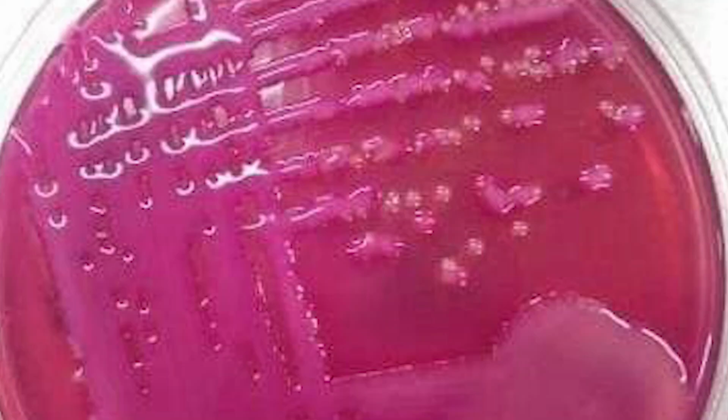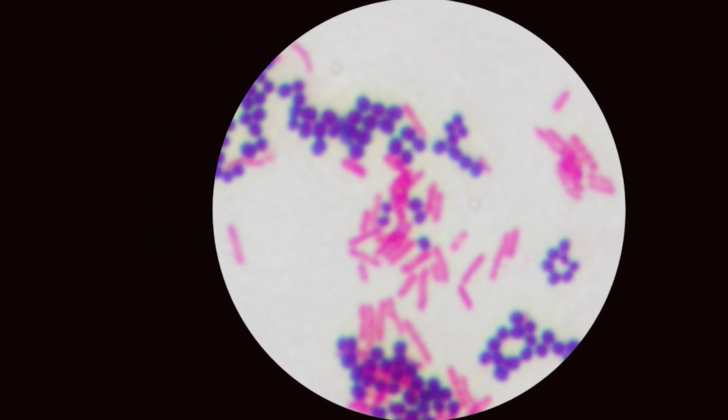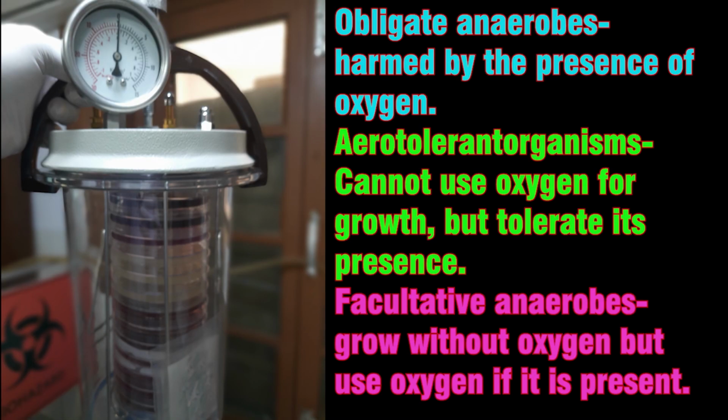for the clinicians. Third, the workup of the specimen can be guided by comparing what's grown in the culture to what was seen in the smear. When 3 types of organisms are seen in the smear and only 2 types are grown in the media, the third could be an anaerobic organism, which needs a special environment for its growth.